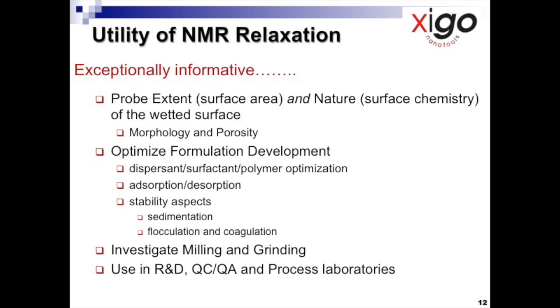It is particularly useful to study aggregation phenomena such as flocculation and coagulation. Because NMR measurements can be made at any concentration, the technique is very convenient to monitor milling and grinding almost in real time. Again, each of these applications will be covered in future webinars.